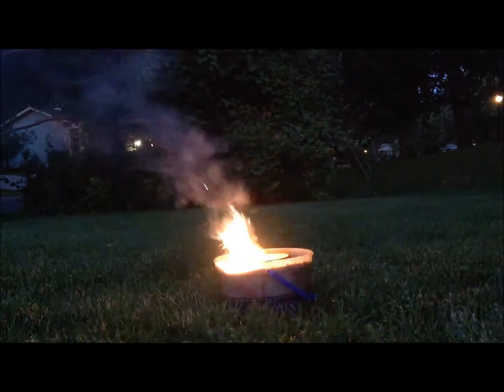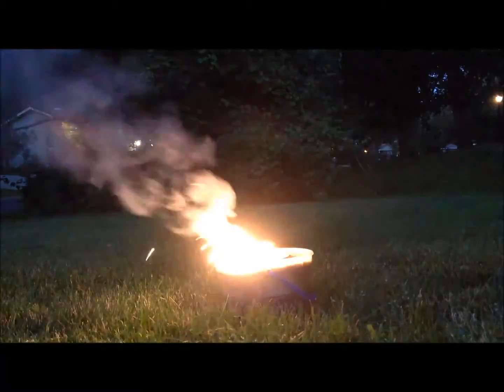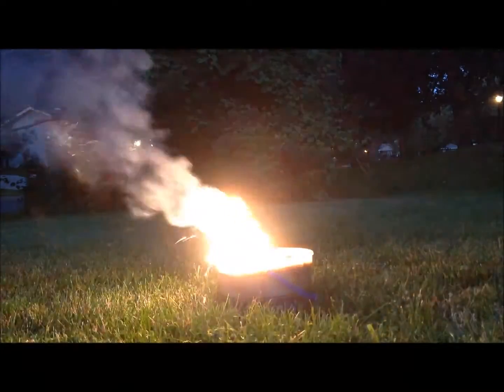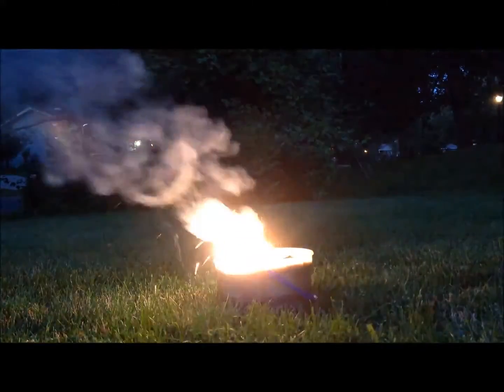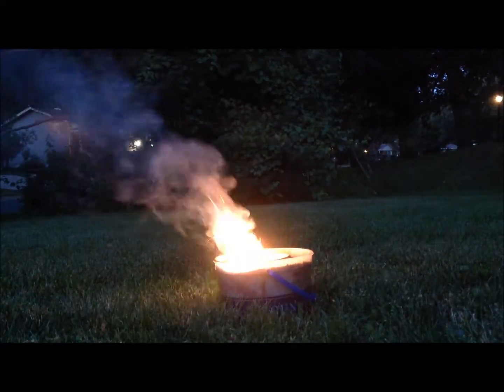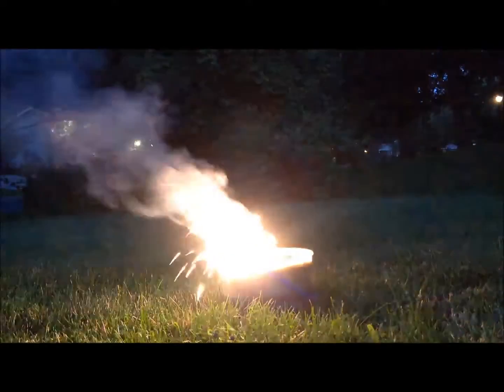I repeated the experiment with finer, ball-milled aluminum powder, thinking that mine wasn't fine enough, but I still got the same result. From searching online, I think that the manganese dioxide powder in batteries has significant amounts of carbon in it, which would certainly hamper the reaction by absorbing heat and throwing off the ratios of ingredients.